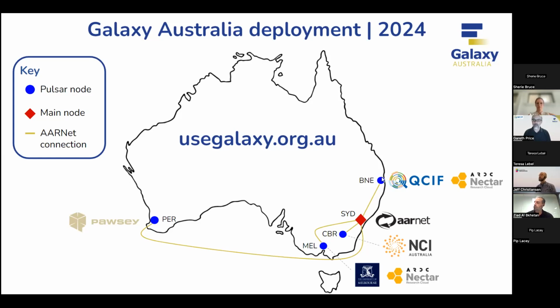And at each of these destinations, we either have access to graphical processing units for particular high-end jobs, or we have high memory or high CPU machines, depending on what you need. And again, from your point of view, that is configured by us. You're always welcome to get in touch to find out about it, but there's no coding magic required by a user of Galaxy, be an early user or a power user, and we definitely have power users that are using Galaxy just as a turnkey engine to generate genome assemblies, genome annotations, proteomics, and everything else.